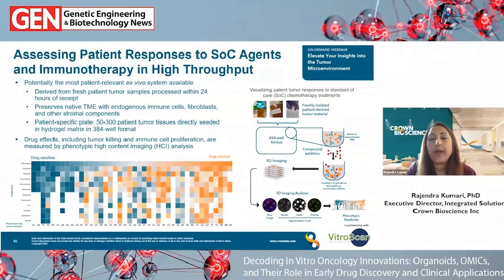Now here at the bottom, the panel of ovarian organoid models have been ranked by their drug sensitivity and resistance to carboplatin, and the heat map visualises the patient tumor response to other agents like paclitaxel and targeted agents like PARP inhibitors. You can also pull out models with specific features like BRCA mutations versus wild type to see which patients are responsive or show resistance.